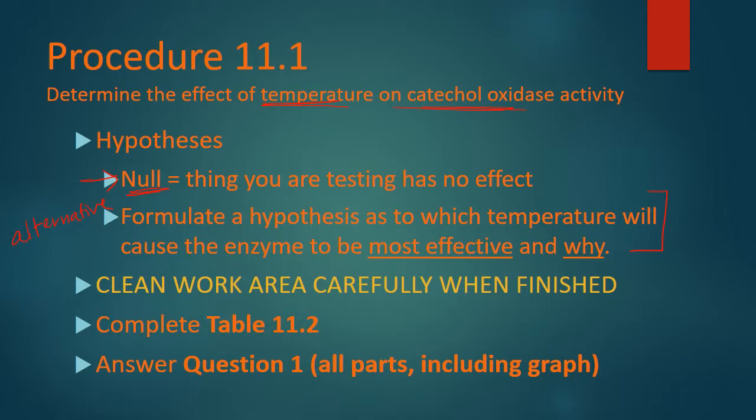When you are finished, make sure to clean your work area very carefully because there will be this catechol. I'm going to make sure to pick up some specific cleaner for these tables because first of all they're disgusting, and second of all because we need to make sure that we don't hurt anybody else after our work. Table 11.2 is found on page 116, and that will be part of your grade on the lab notebook to do that. Also answer question 1, and I will have graph paper available for you to paste in your notebook if you so desire.